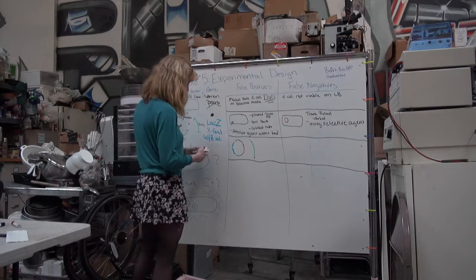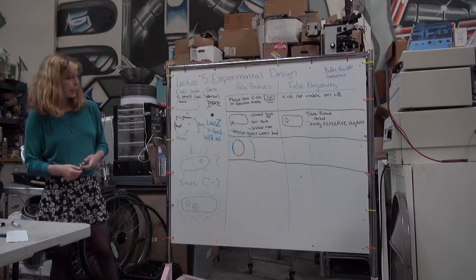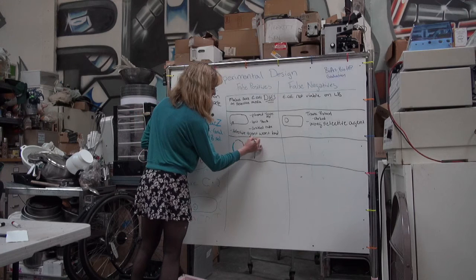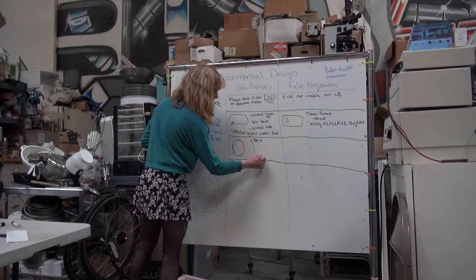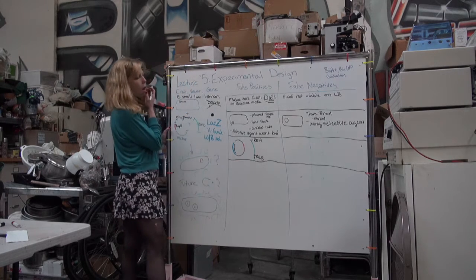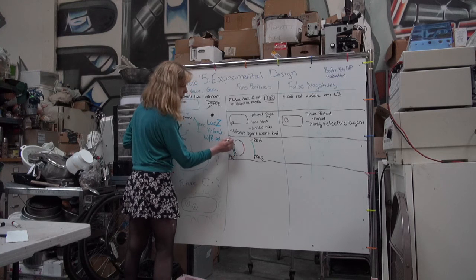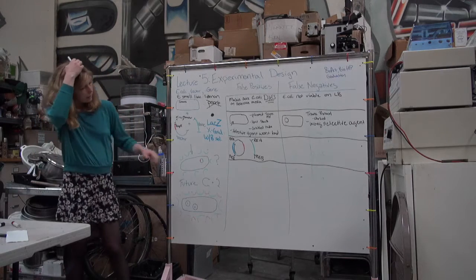To do this process, we would take a restriction enzyme, one specific one. So, A, restriction enzyme, B, right? And we make sure it's the same orientation as this one. So let's pretend like this is the arrow. So beginning, right? This is the beginning of the arrow. Restriction enzyme B, restriction enzyme A. Bada boom, bada bang. It will get in here.